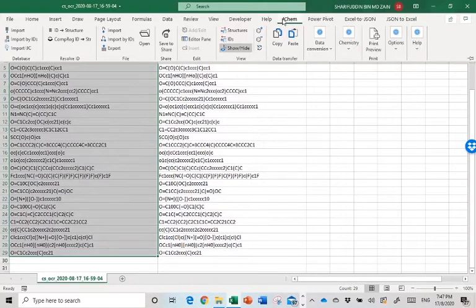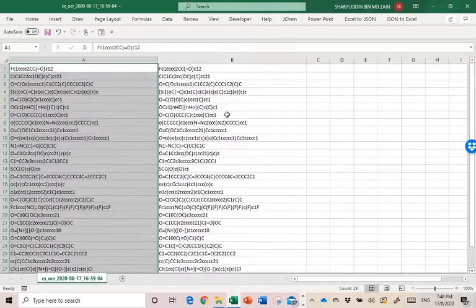And the good thing is that JChem for Microsoft Office and all the programs produced by ChemAxon are licensed, but the license is free for teaching and university research purposes. So you can download JChem for Office and then apply for the license. Right, so you've got all the structures there, all selected.